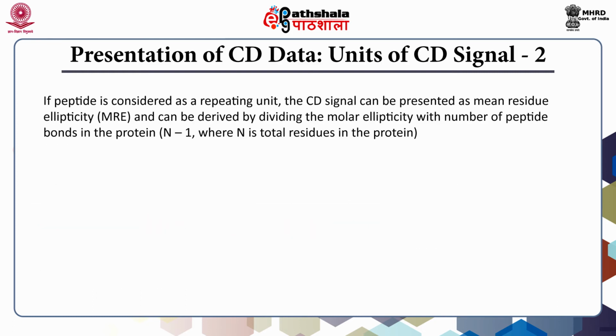If we see, a protein is a polymer of amino acids, and one protein differs from another in its number of residues. So it can be a good idea to normalize for the length of the protein also, with the number of residues.